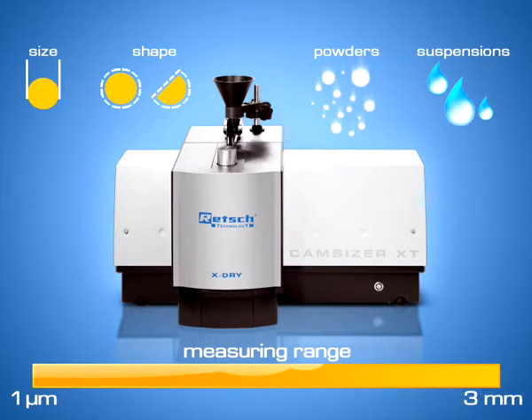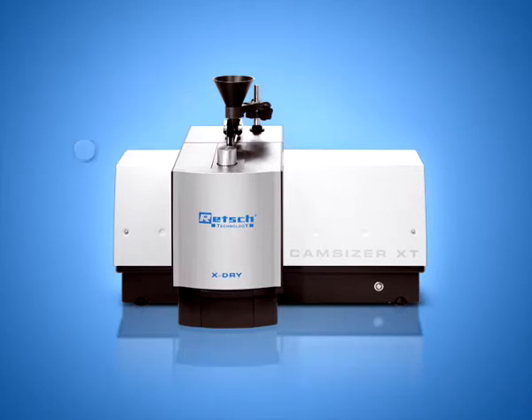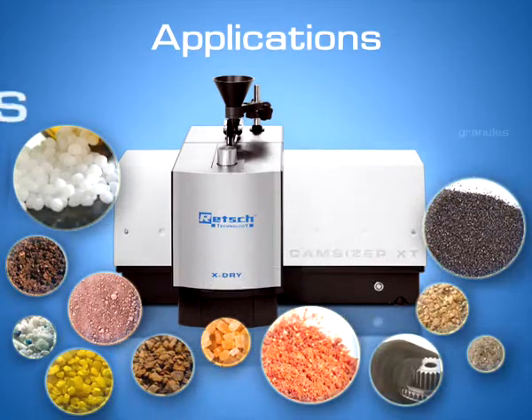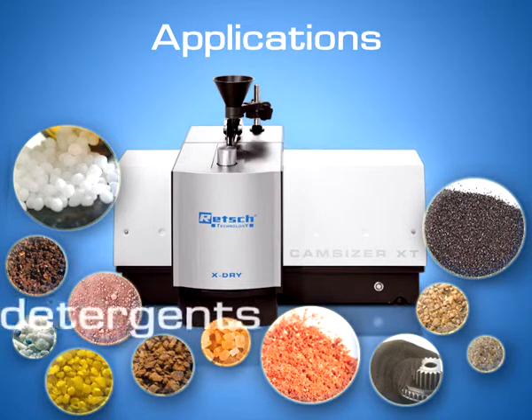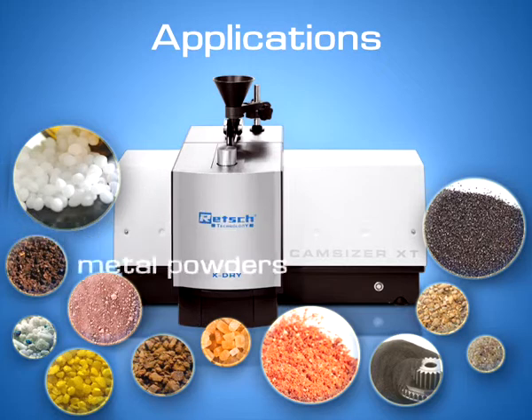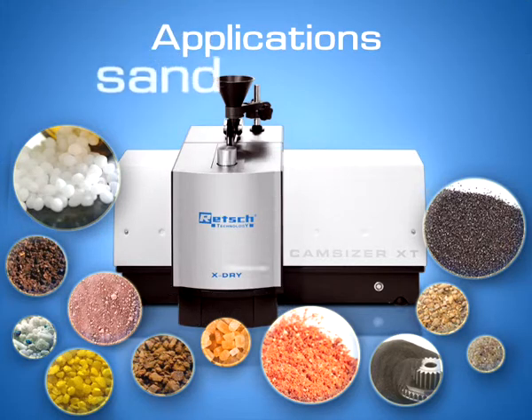Thus, the CamSizer XT is ideally suited for applications such as pharmaceutical powders, granules, and fine pellets. Pulverized and granulated food, such as ground coffee or instant beverages, detergents, plastics, metal and ore powders, abrasives, sand and cement, as well as fibers.